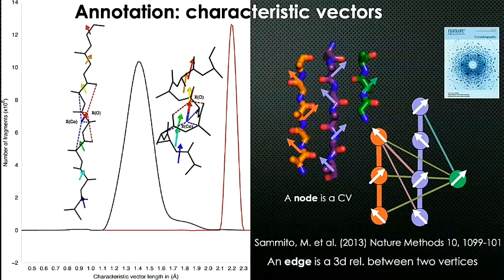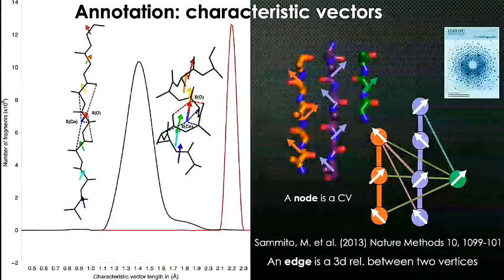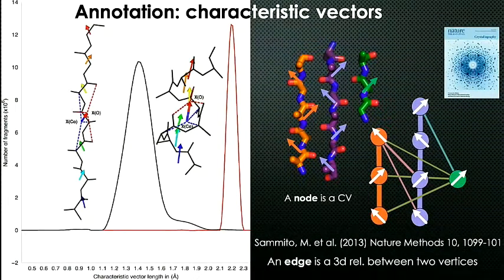So, as I told before, we need to have a geometrical descriptor to avoid the use of the sequence for extracting the models. And Isabel already came in 2013 with a nice idea of building some vectors from the main chain. If you have 3 consecutive residues, you can always compute the centroid of the carbon alpha atoms and the centroid of the carbonyl oxygens, and you just link these 2 points, and you end up with a vector. The length of this vector is telling us about the secondary structure, because, as you can see here, we have 2 different distributions for this length, one referring to the alpha helices and the other referring to the beta strands. And also the direction of the vector is telling us about the secondary structure, because in the helices it tends to coincide with the direction of the helix, and in the beta strand we have an alternate conformation.